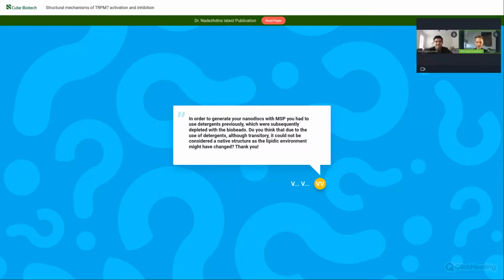So the last question is asked by Victor Venturini, and he's asking, in order to generate your nanodiscs with MSP, you had to use detergents previously, which were subsequently depleted with biobeads. Do you think that due to the use of detergents, although transitory, it could not be considered a native structure, as the lipidic environment might have changed? Oh, yes, this is absolutely true. Although some people claim that nanodisk provides a native environment for the membrane protein, this is not true at all.